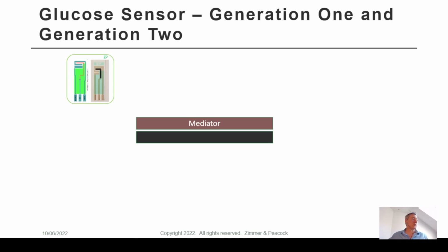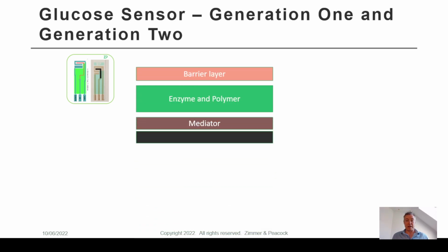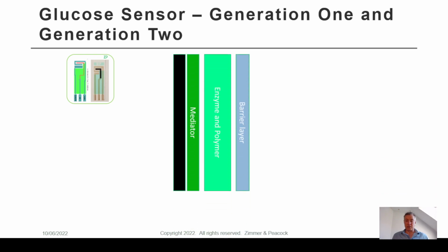These are basically chemicals that are able to take up or give away an electron, and they're able to shuttle electrons between chemical reactions and electrodes. So we have a mediator, we might have an enzyme layer. The enzyme is what gives the specificity, and then we might have a barrier layer, and I'll explain the barrier layer in a minute. So I'm going to describe it with a practical example, glucose. Glucose in real samples is actually quite high. I know the word 5 millimolar sounds like a low number, but in biological terms, it's actually quite a high concentration. It's not very hard for that kind of concentration to overwhelm the enzyme. We simply can't get enough enzyme down to keep up with all that glucose.